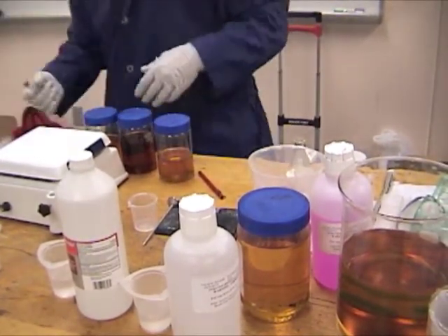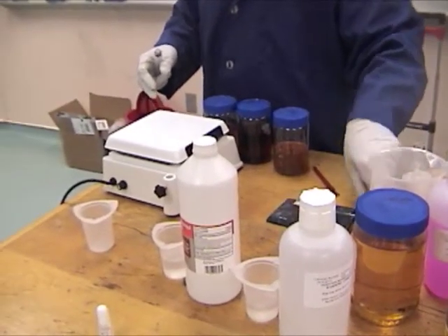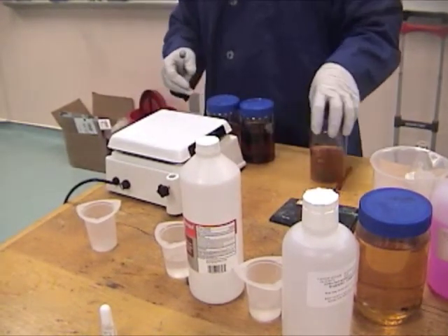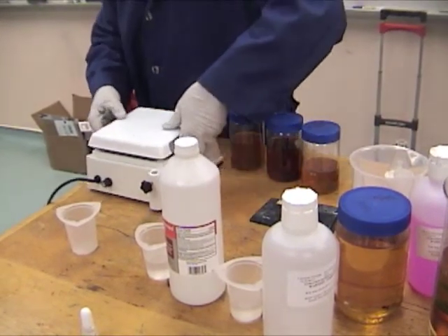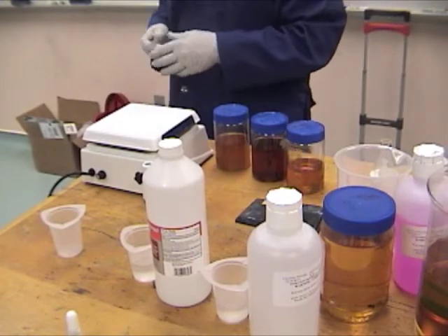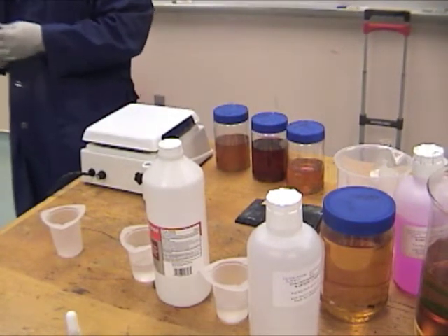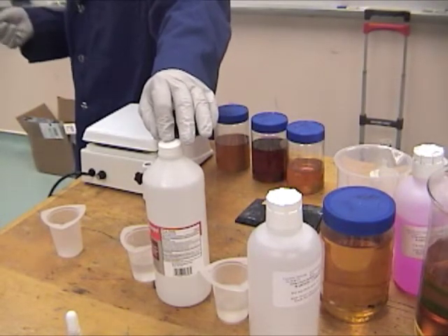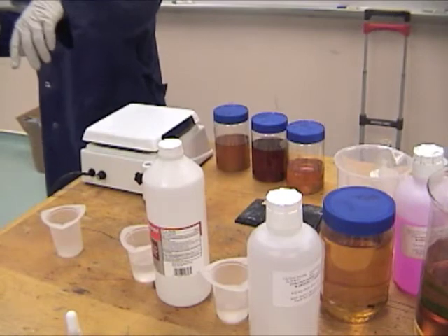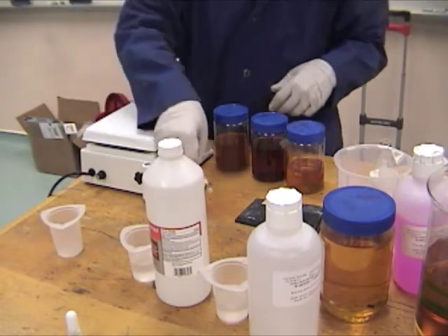So if you have 91% isopropyl, would you add then 11 milliliters in your titration solution because you're 10% shy? No. The strength doesn't make any difference. You can use 70% or above. The isopropyl is just a solvent. Okay. It won't throw it; that exact amount isn't important. Right. And because they're using distilled water when they make this stuff, it doesn't have a pH. However, we are going to talk a little bit about that. There's something called blanking a titration we'll talk a little bit about. So please. We will.